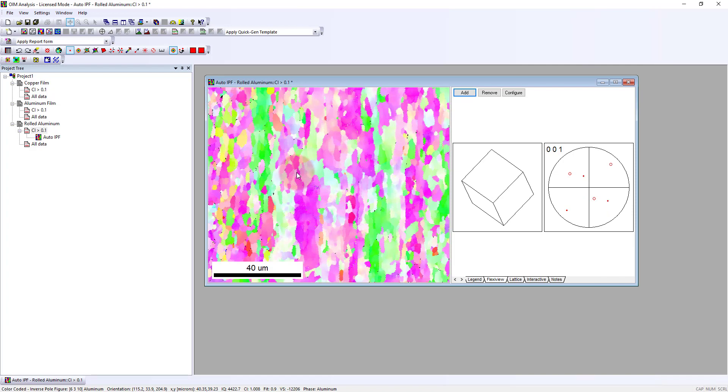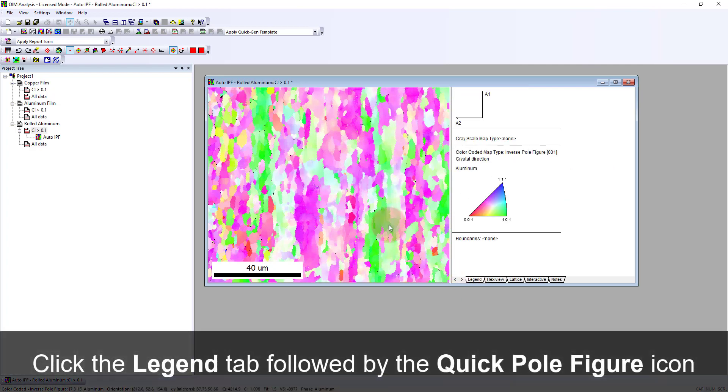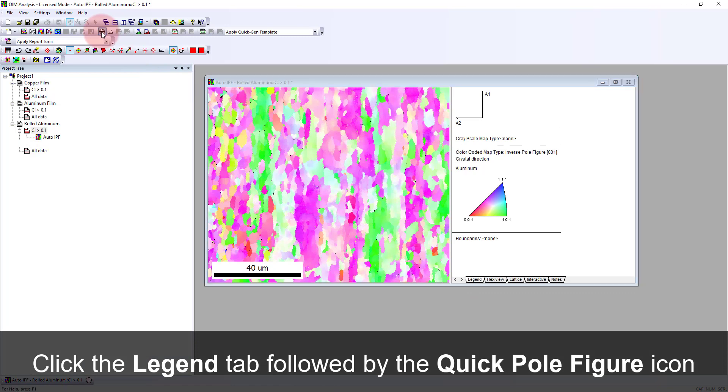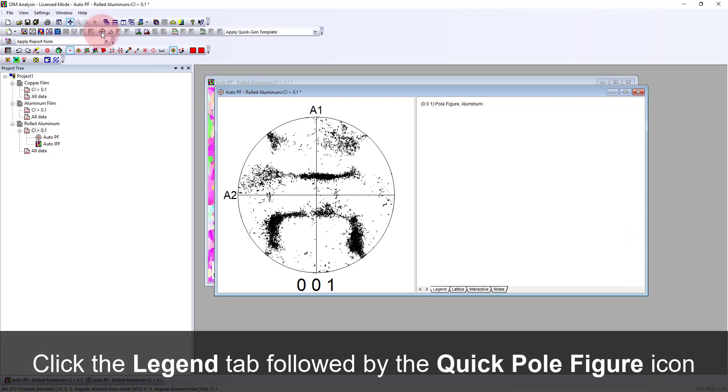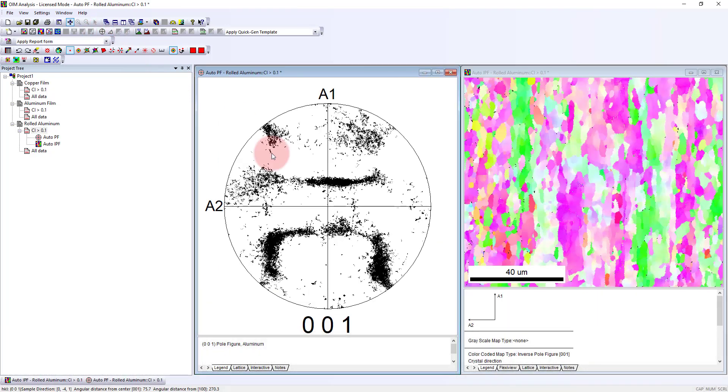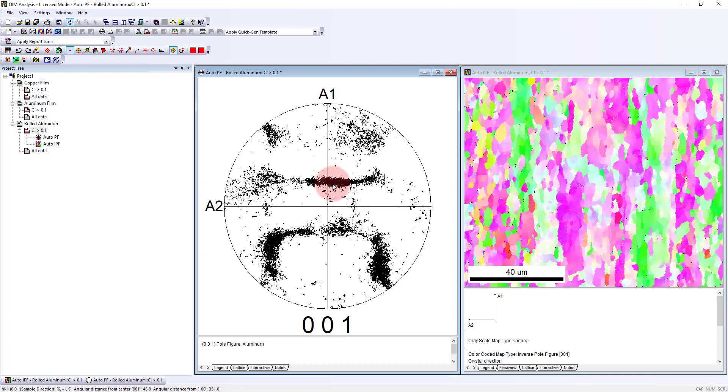Generally, we don't look at these one at a time. I'm going to click here on our quick pole figure to look at our default 001 pole figure. Here, each pixel from the orientation map is plotted in this 001 pole figure, and we can see there's some clustering involved here.